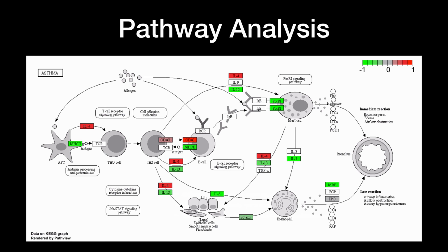Collectively, when we put this all together, we can begin to get a rather detailed initial view of how airway inflammation can be perturbed with these types of steroids that we are analyzing in this week's lab. And we'll discuss some of the biology and some of the details that were emerging from these experiments when we analyze this data together.